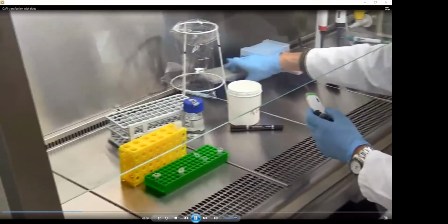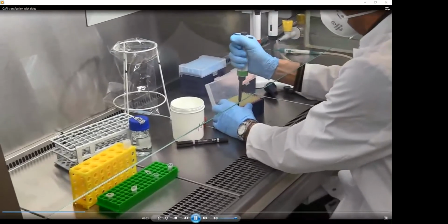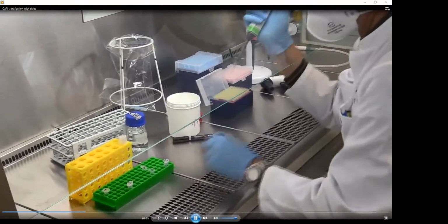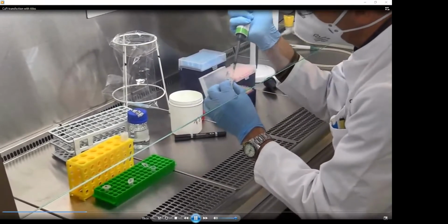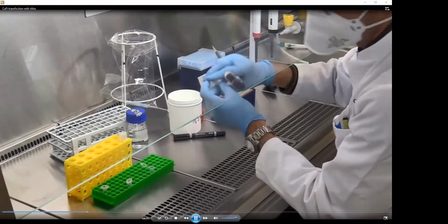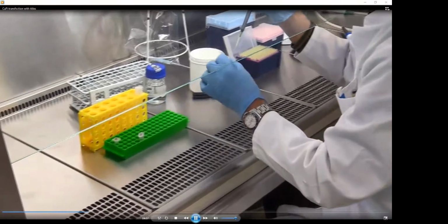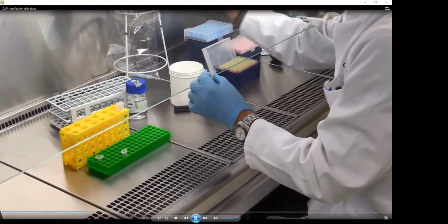Then you have to take the tip, and what we add next is this reporter. We add it to the solution B, and mix it properly.